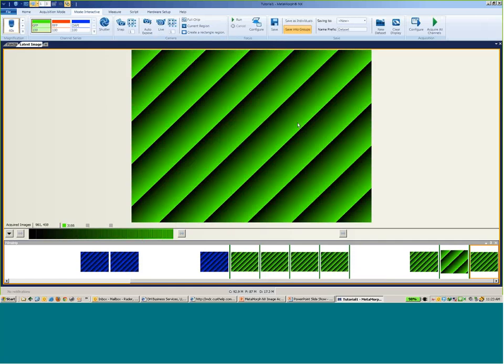Additionally, you can set the acquisition frequency as every time point, or only the first time point, first and last, or every nth time point options that you have configured there. And then you can export and import acquisition protocol files from the buttons here, which is the same as in the acquisition mode at the top. So once you have things configured and you're wanting to do another acquisition, you just hit acquire, and you're ready to go.